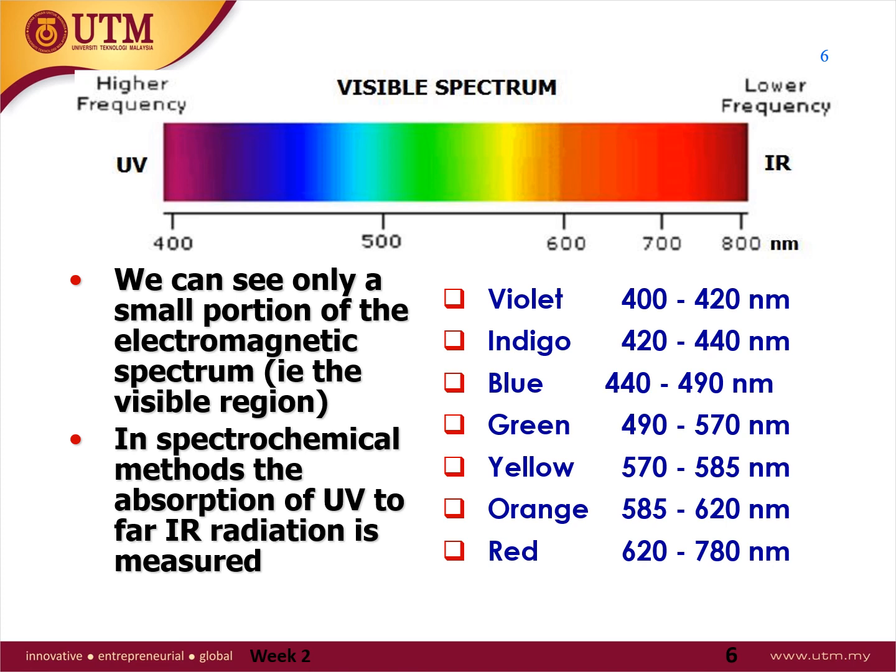If, let's say, you see, for example, purple, it absorbs something. What is that something? You can refer to the color wheel that is available everywhere on the internet. It is even learned in the physics syllabus. I think last time it was the wheel of the color, whereby it absorbs something and it will transmit the color that we can see.